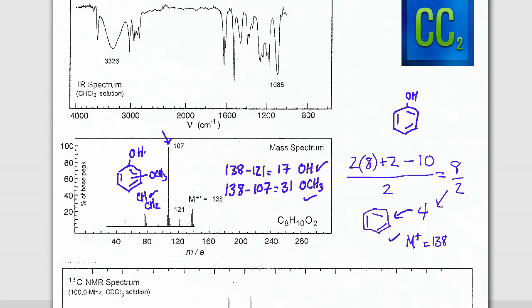But if you look at something with a CH2 around, like this, which would be a very stable ion because of the resonance, if we put a plus there, that comes out to about 108. So perhaps we have some sort of form, maybe plus or minus a hydrogen, of this type of structure right here, okay? And again, I'm sort of arbitrarily placing the CH2 right now. It could be in any of those positions in terms of the resonance.